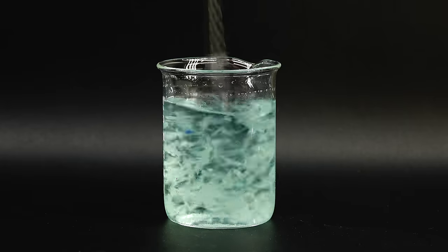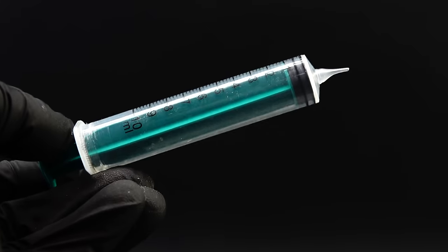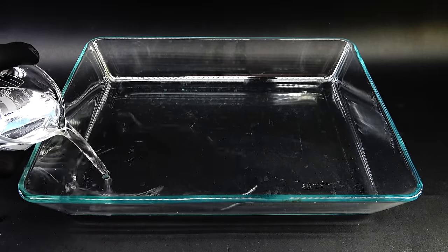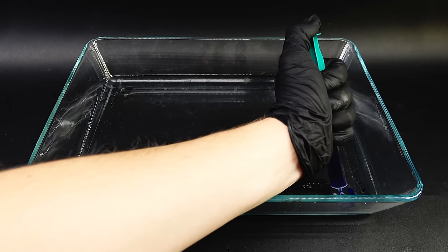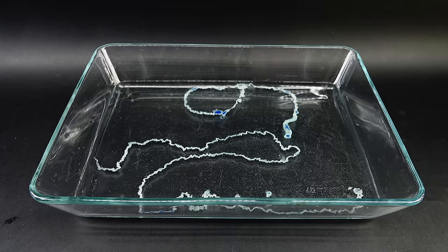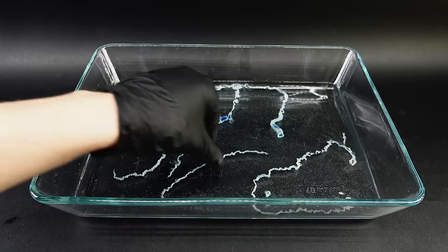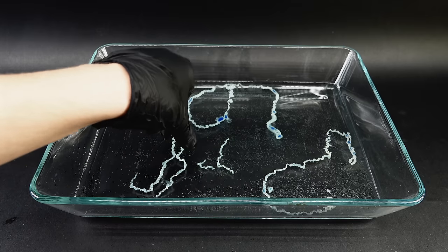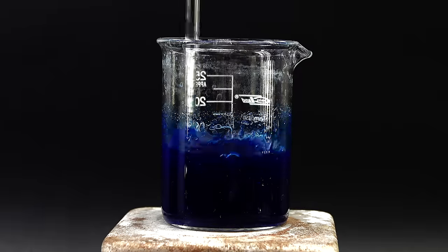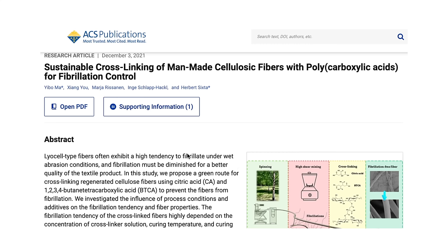Before ending this project, I wanted to try making my cellulose into an actual fiber, and for that I had to make a few improvements to the process. First, I made a designer syringe to extrude a much finer stream of the cellulose solution. I also used a big glass baking tray for the acid bath to avoid moving the newly formed fibers around too much. I then carefully used the syringe to create a very long and thin fiber, which I then left to marinate in the acid for a good while. When I came back, I hoped that it would be at least a little stronger than the previous one, but upon touching it, it pretty much instantly fell apart. I was really quite disappointed, because I put so much work into preparing the materials to make those fibers, and the results I got were just trash. I figured that to make real fibers, I had to do a lot more research and buy more equipment, because using a random syringe didn't feel quite right, and I've actually already got quite a few ideas on how to improve this whole process and make my dream of making some chemistry merch at home come true.